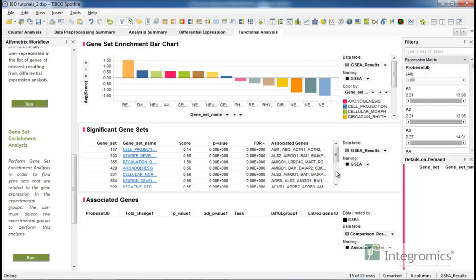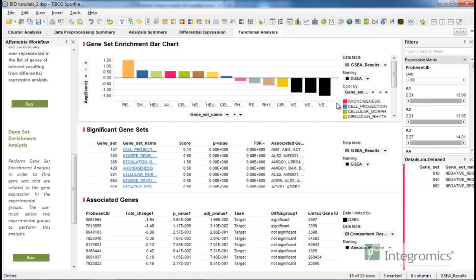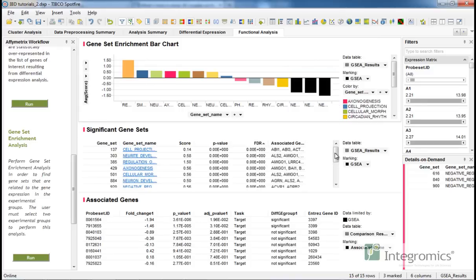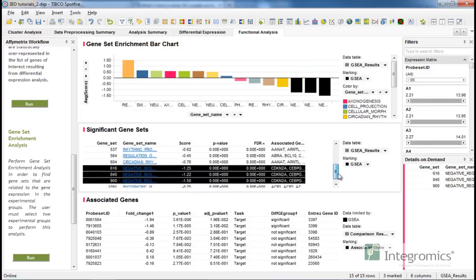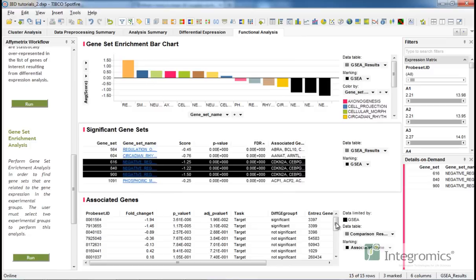For each geneset in the Significant Gene Sets table, the genes of the currently analyzed array can be inspected by marking the corresponding line. Genes and probes belonging to that geneset will be shown in the associated gene table.